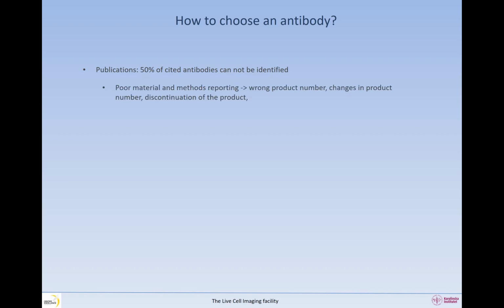Of course, another way is to go directly to the companies who are selling the antibodies. Then you find what you want, but you should be very critical. When you look at and buy that antibody, see that it has a complete data sheet available, containing as much data as possible about that particular antibody: Western blot, stainings, images, usage recommendations.